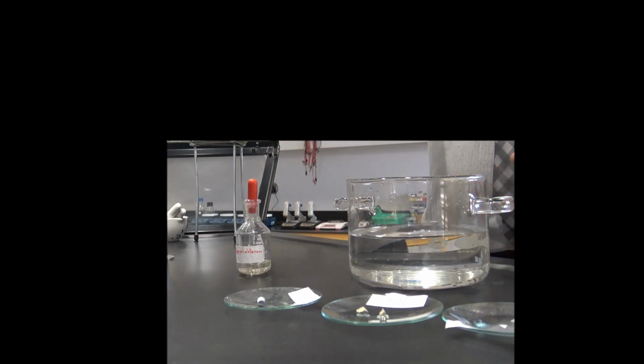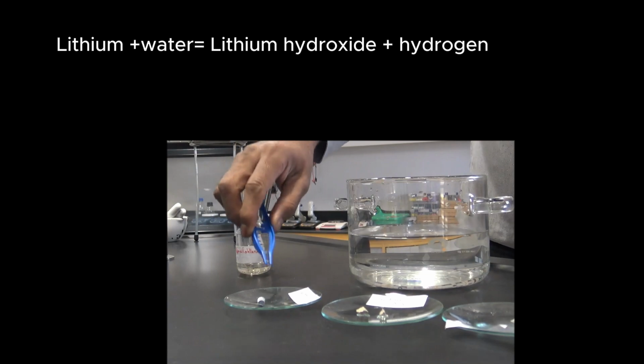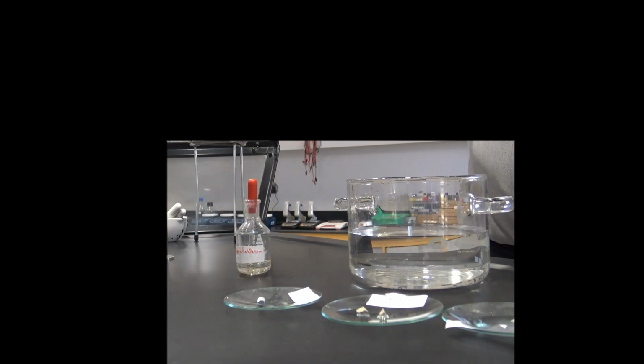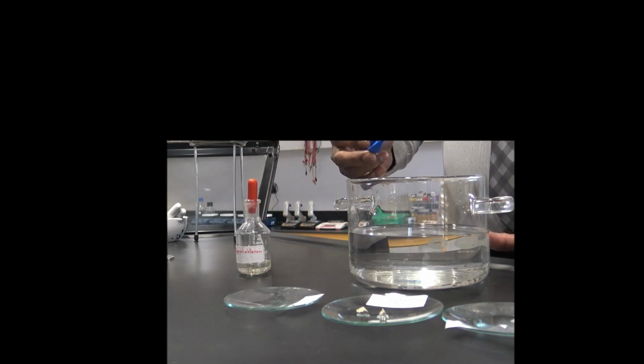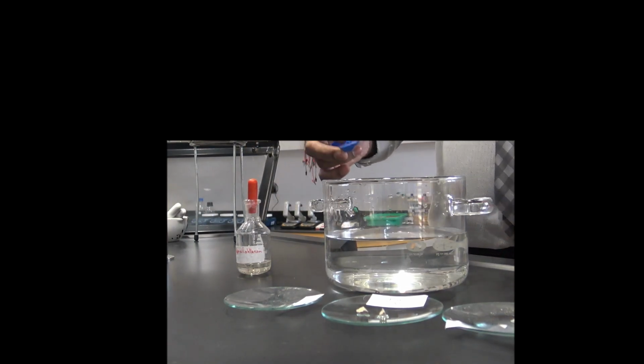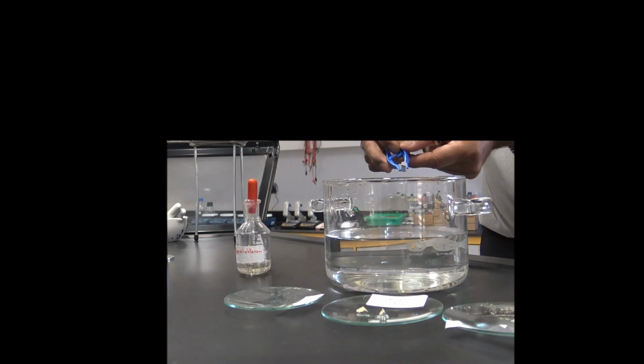So we start with the least reactive. I expect this is lithium, but I can see the size of the lithium piece is bigger, so maybe the reaction will be faster. But overall lithium is less reactive than sodium and potassium. So we start, and you can notice the reaction.